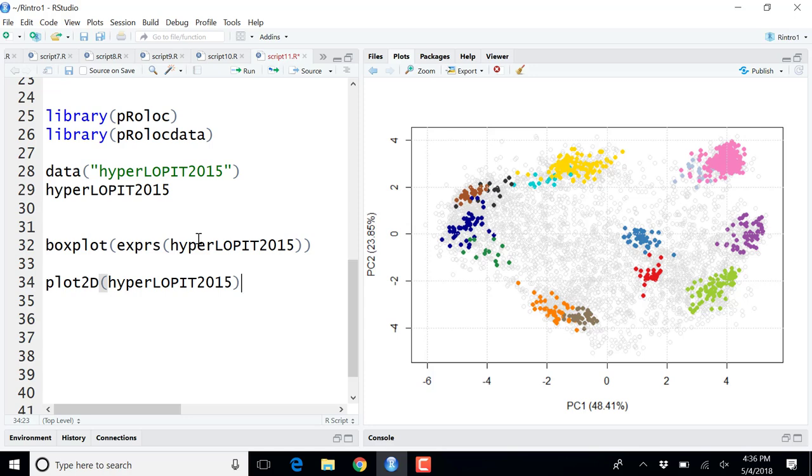And this plot is then annotated automatically, and in this case, the colors represent some subcellular annotations. So here we have subcellular clusters. Of course, this is data about spatial proteomics, but if you had data about something else, you could also plot the samples and so on. So these are some built-in functionalities that come from using packages that are aware of the data that you have.